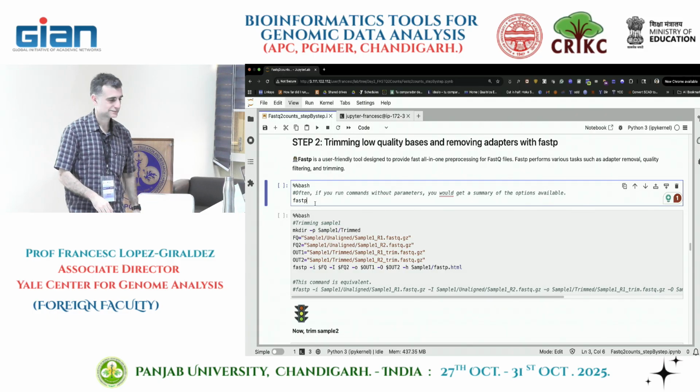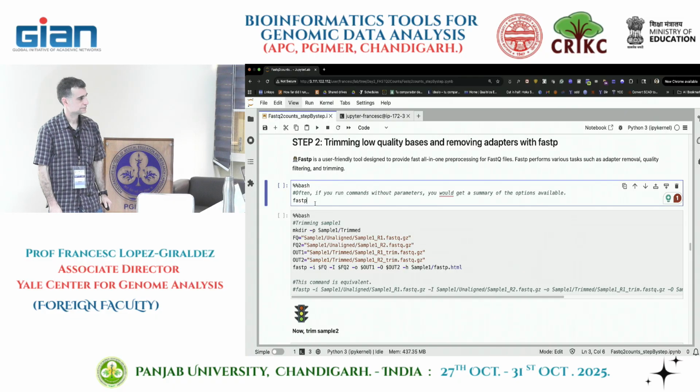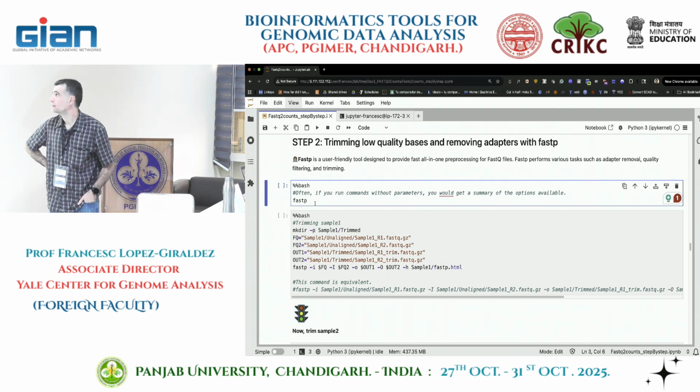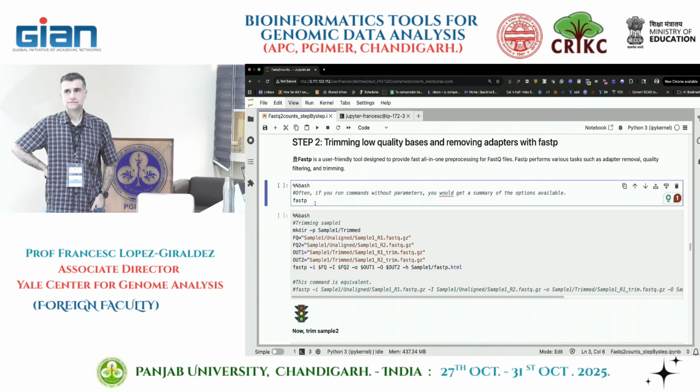So when it is 2 x 150, meaning paired-end reading and 150 cycles, right? Yeah, 300 cycles from both ends. From both the ends. And on this technique, you are adding reagent for 300 cycles. If you tell the machine that you want to do 300 cycles, it will just sequence from beginning to end, 300 cycles. You can also say, okay, you do 2 by 150.